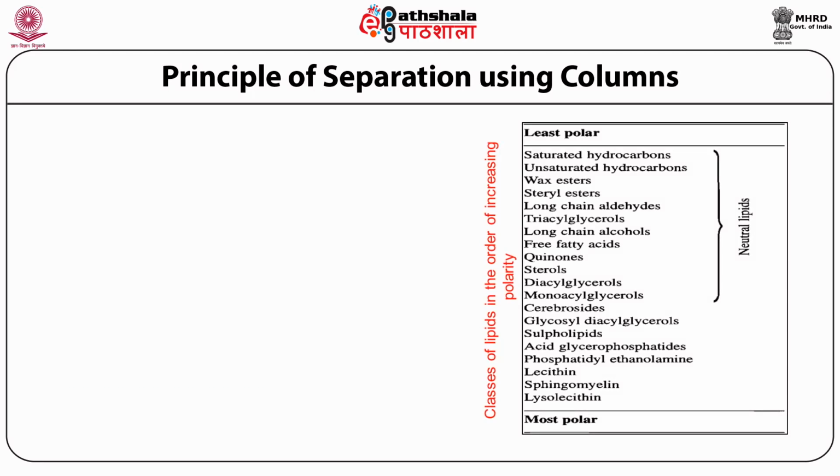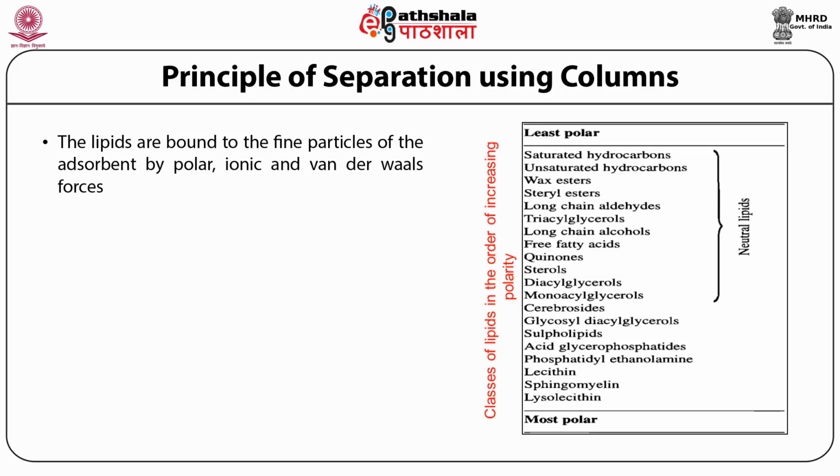So in adsorption chromatography, the stationary phase comprises silica gel, while the mobile phase will comprise a mixture of organic solvents. So the lipids that are polar would bind to the fine particles of the adsorbent by polar, ionic, and van der Waals forces, and therefore they will be retained for a longer time in the column or on the TLC plate.